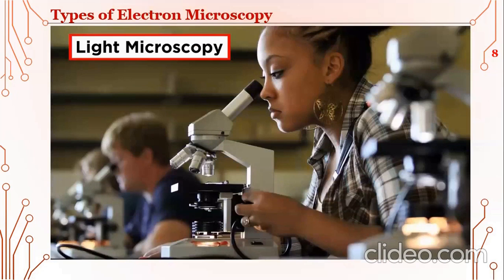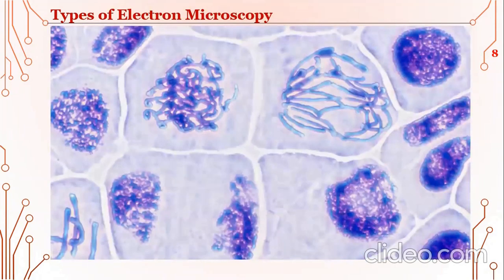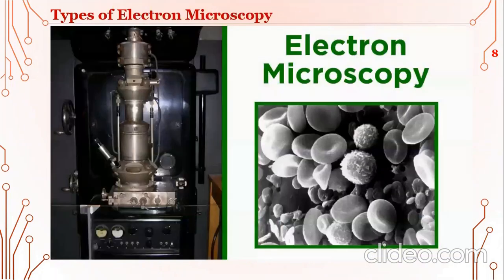We just learned all about light microscopy, which was the standard until the middle of the 20th century and remains tremendously useful today. But as we began to learn more about the microscopic world, using light microscopes that could visualize individual cells, we started to become curious about structures that are smaller than a cell, some details of which were difficult to visualize and study under standard light microscopes. Fortunately, electron microscopy, developed in the 1930s and 40s, proved to be much more powerful and allowed scientists to view these smaller structures.